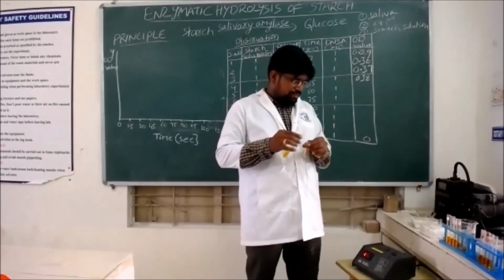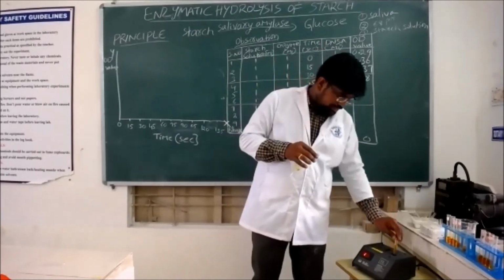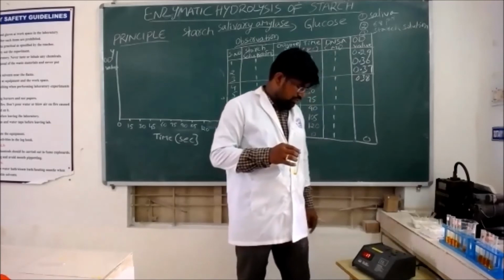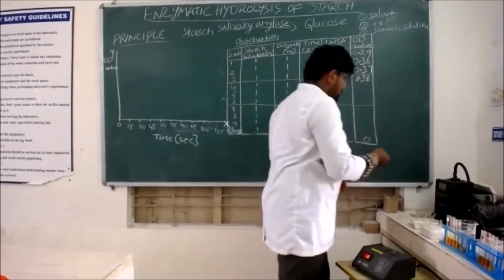So next, the fifth tube. The absorbance is 0.46.